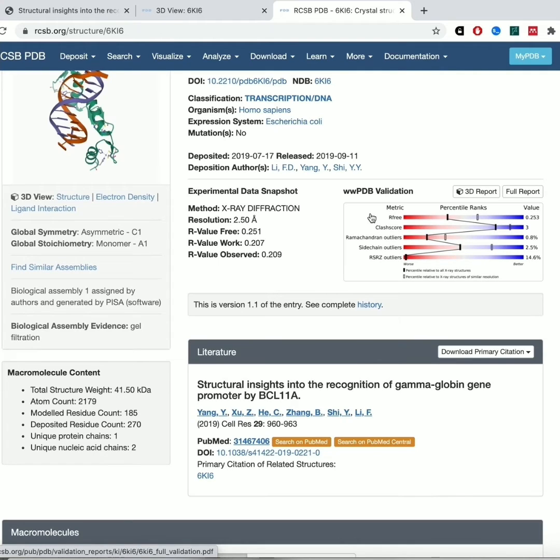When it comes to the making sense part, we're talking about whether the atoms can physically be where your model says they should be. One of the big things is steric clashing. Basically that's the idea that two molecules can't be in the same place at the same time, and that molecules need their personal space. So you have this clash score where if the electron clouds are too close, so that it wouldn't be physically possible, that'll be a ding on your clash score.